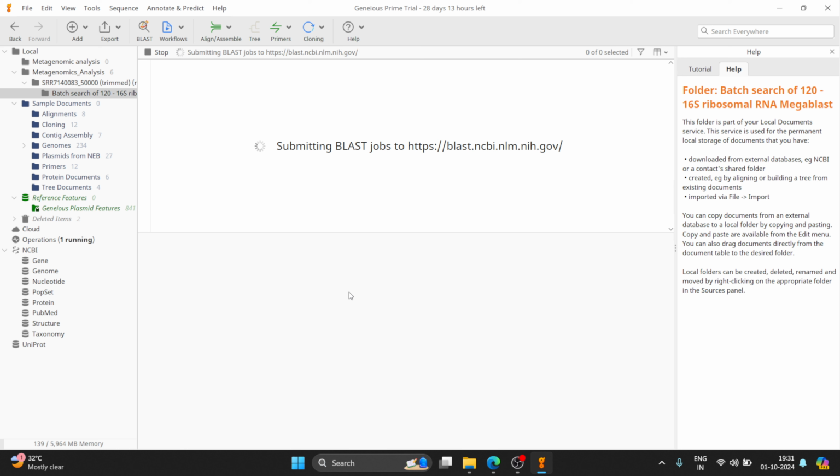For me, I guess for doing the blast, it is taking much time. So if it is done, we will make its part two. In part two, we will create a database from the hits which we'll get, and after that, I guess everything will be good. So yeah, I guess it will take some time for me.